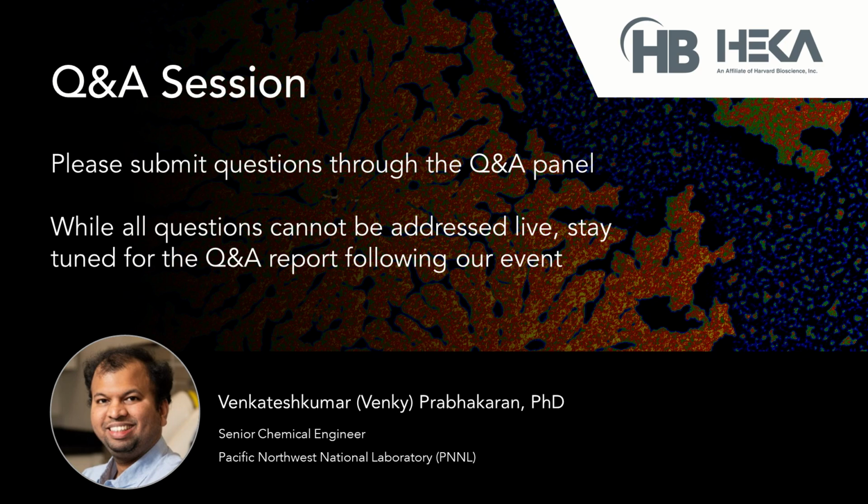The SECCM bulk is what I mean is that you still use a theta capillary, but you immerse it and use it in a way like SECM, wherein the entire surface is still exposed to the water. So you don't have the micro-droplet based measurement. Rather, you control the diffusion through the nano channels at the tip. So that's why we are still calling it SECCM bulk.